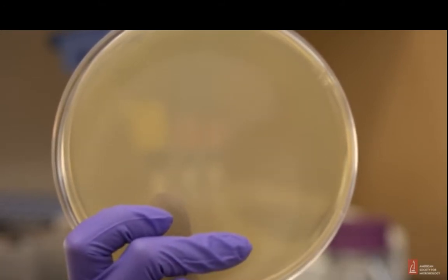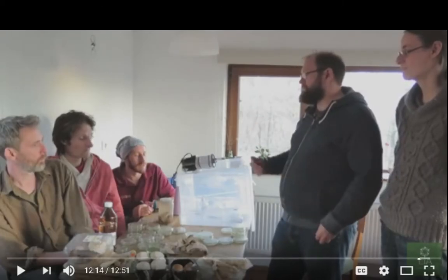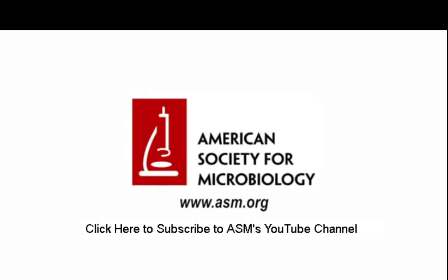No, where are we? Oh my gosh. I don't even know where I was now. I was right over here. So I didn't know about turning the plate over to make sure there's no moisture.